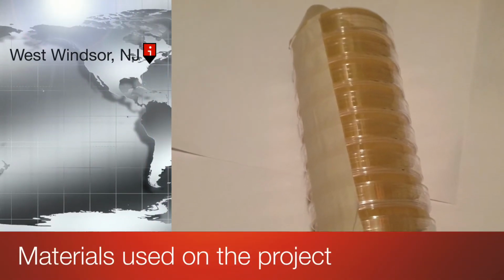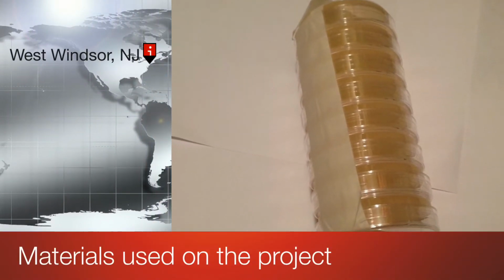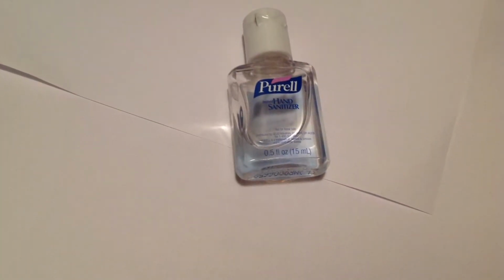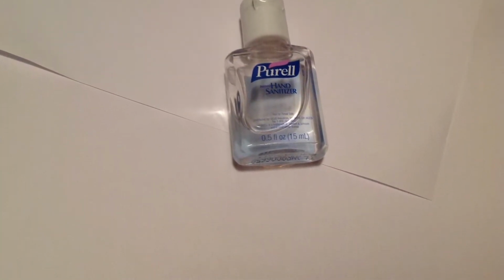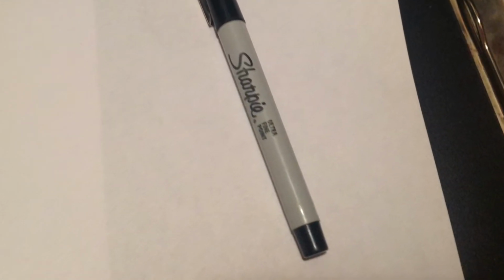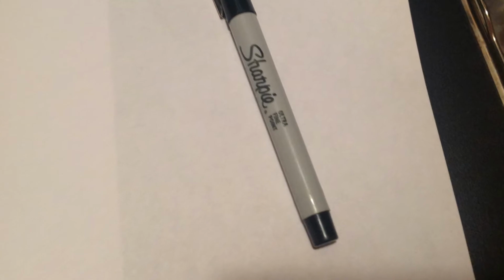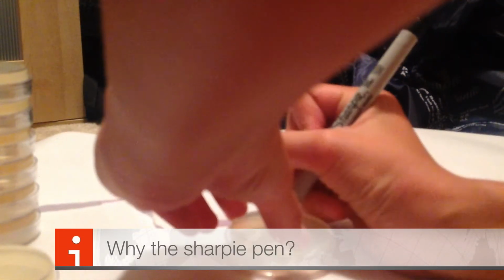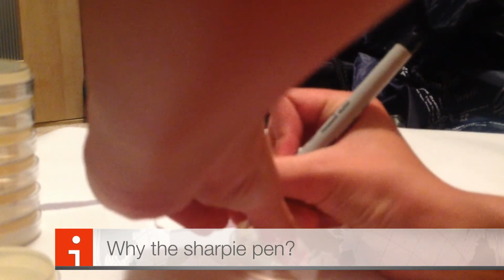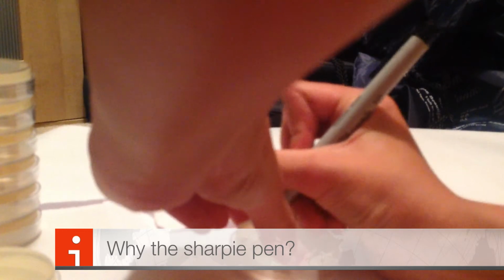Hello, ladies and gentlemen. These were the materials I used in my project. I used petri dishes, hand sanitizer, and a Sharpie pen. If you have not guessed it already, my project was all about testing how well hand sanitizer worked or didn't work. You may wonder what I need a Sharpie pen for in this experiment, but I used it for marking where I would swipe my dirty and clean fingers.